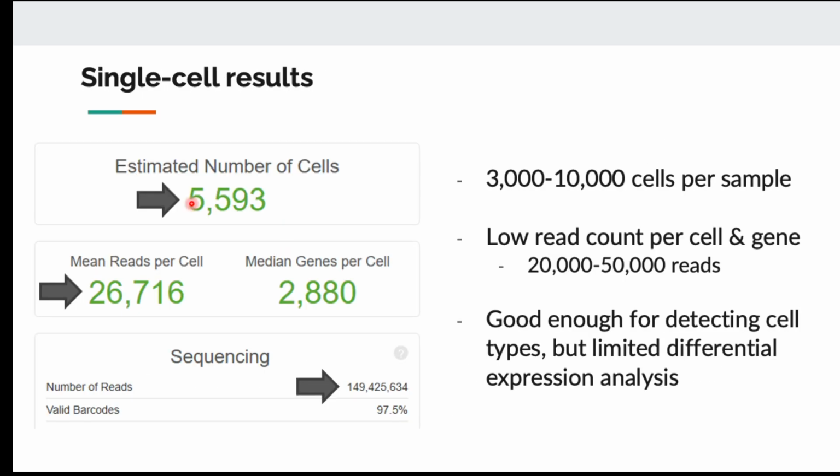Okay. So a big difference between bulk transcriptomics and single cell transcriptomics is the amount of data that you are getting. Usually in bulk RNA sequencing, you have replicates. You maybe culture the cells multiple times, or you get the RNA from multiple patients. You get one number for each gene, for each patient, for each sample. You measure a gene only one time.